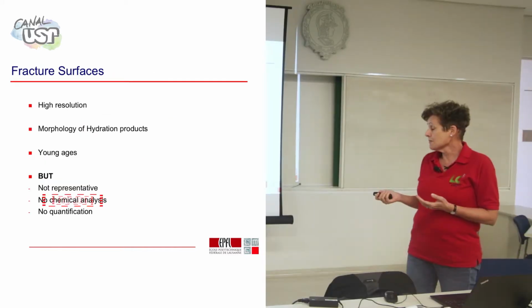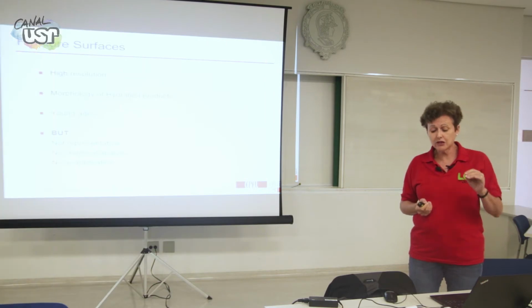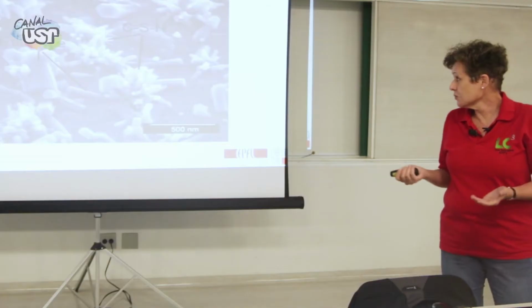And you've got no chemical analysis. People are always making the mistake of thinking you can do chemical analysis on fracture surfaces. You can't. It's wildly inaccurate. And you've got no quantification. So this is what you can see.